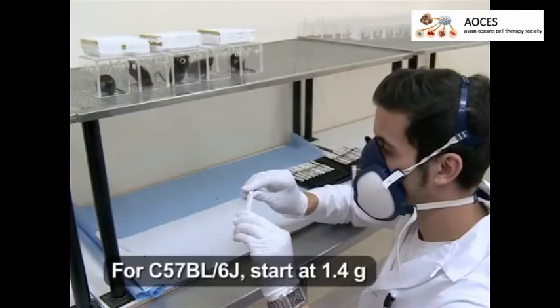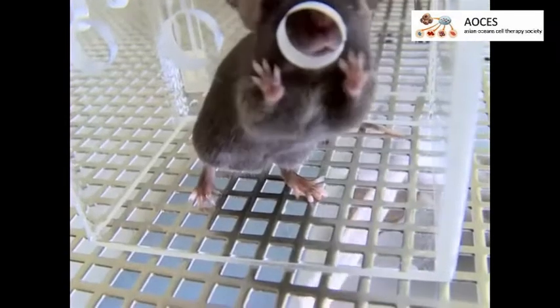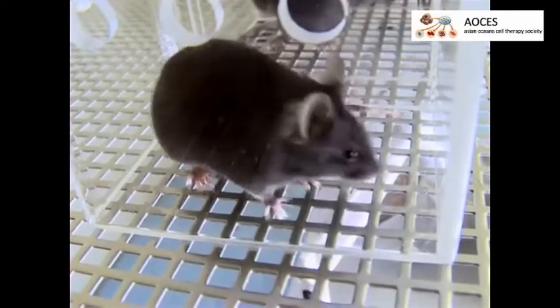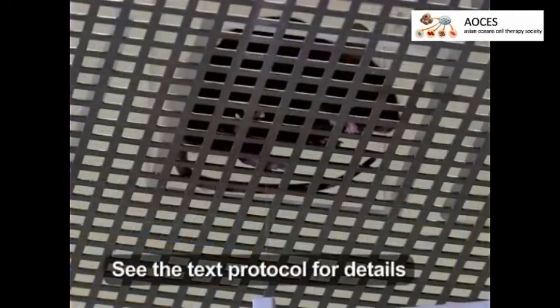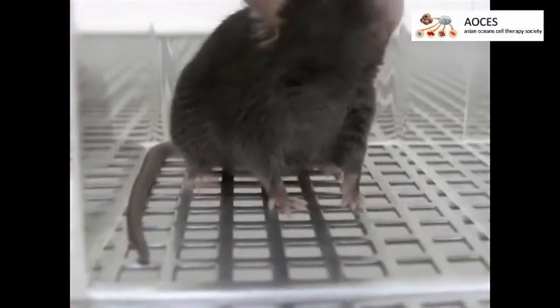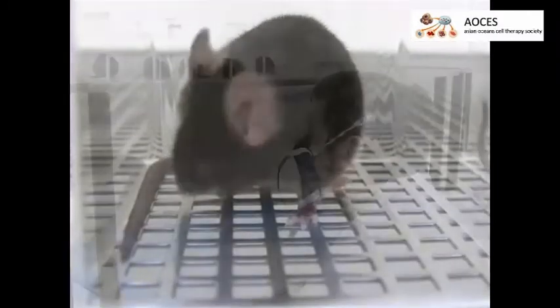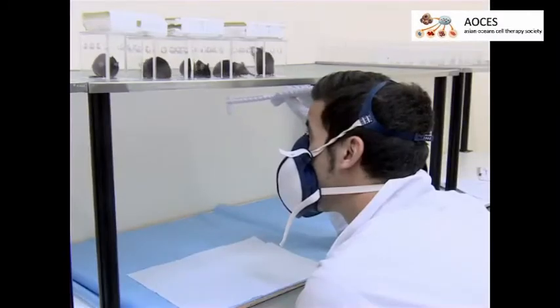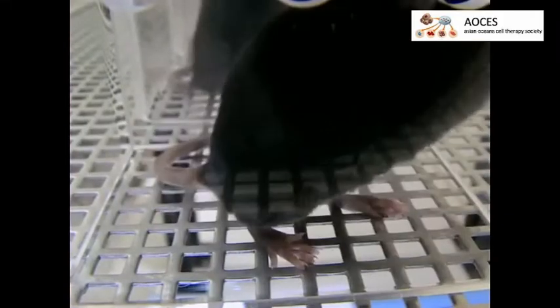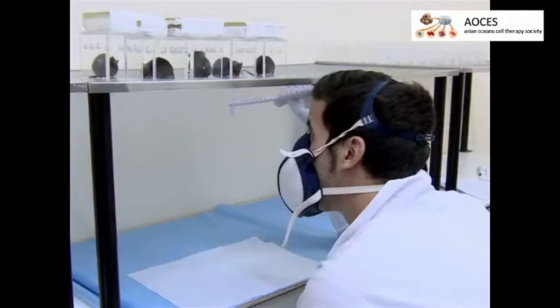Start with the lightest pressure when measuring thresholds. To test the mice, apply the filament to the left hind paw until the filament begins to bend. Avoid the lateral borders of the paw, which can be more sensitive. The animal reacts to the filament application if the paw flinches or is withdrawn; repeat the application twice more.